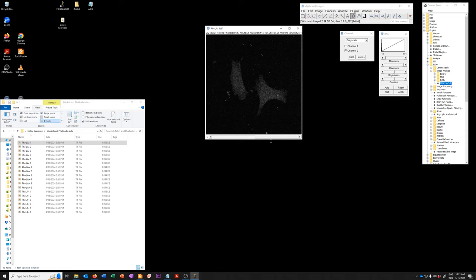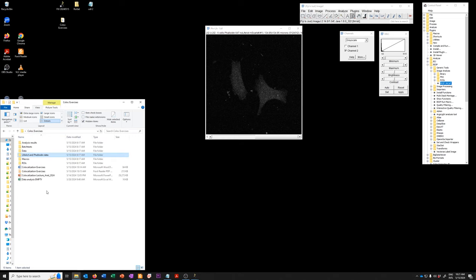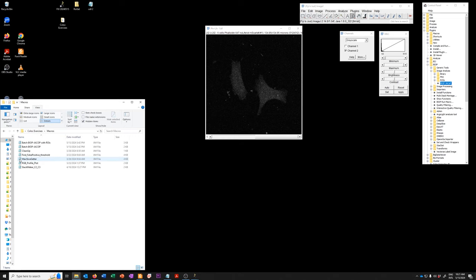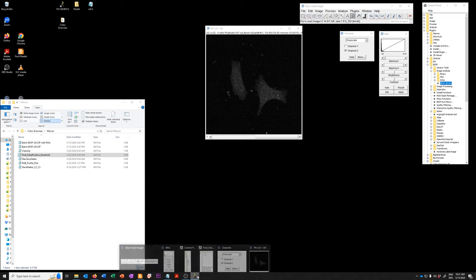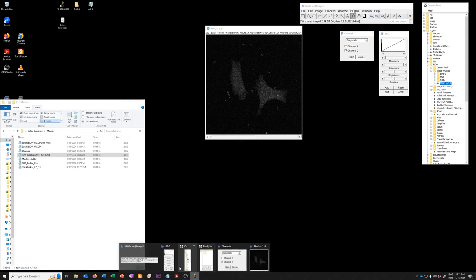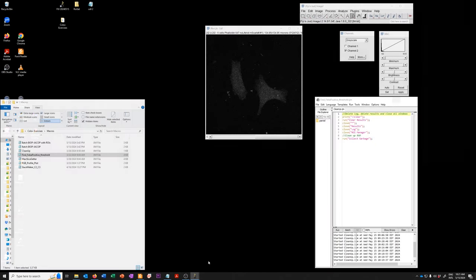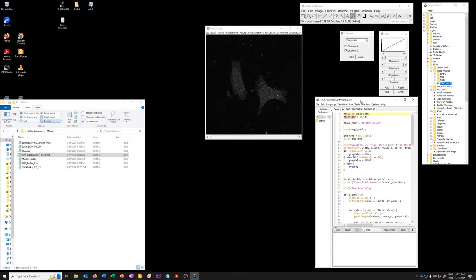So how do we use this image to get a threshold? We're going to use a method developed by Roman Guiet and he wrote a macro that I've just included here, I did not write this, he wrote it, called find false positive threshold which we're going to drag into the Fiji script editor.